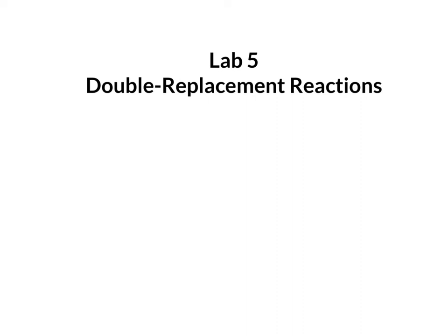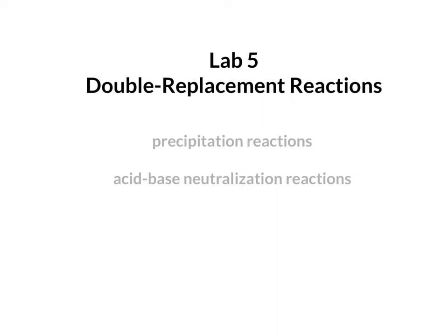For Lab 5, we're going to be looking at double replacement reactions. This includes precipitation reactions, acid-base neutralization reactions, and gas formation reactions.